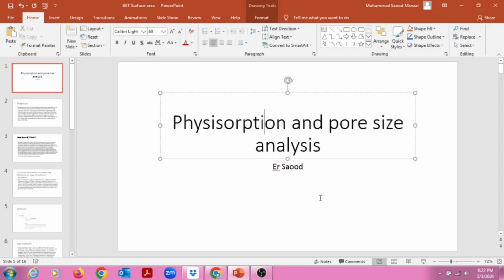Now, BET basically refers to the observation of physical adsorption, or physisorption. This theory applies to systems of multi-layer adsorption that utilize a probing gas, called the adsorbate, that does not react chemically with the adsorbed material it attaches to, in order to quantify the specific surface area, or you can say surface area.